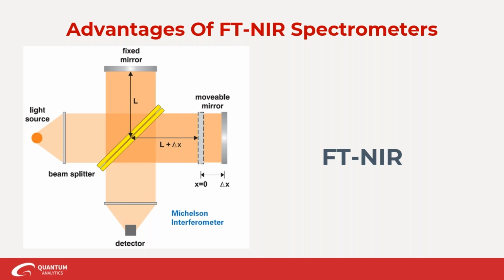And then, back to me and my job as an applications engineer, these instruments are pretty reproducible. What that means is, to transfer a calibration model that you build on one spectrometer to a different instrument, the requirements are pretty minimal. It's pretty easy to do, and with some other types of instruments it cannot be so easy. So there are a lot of advantages to the FT instruments.